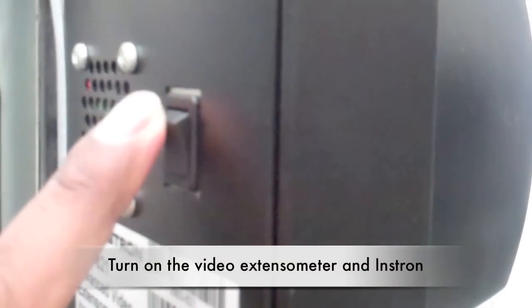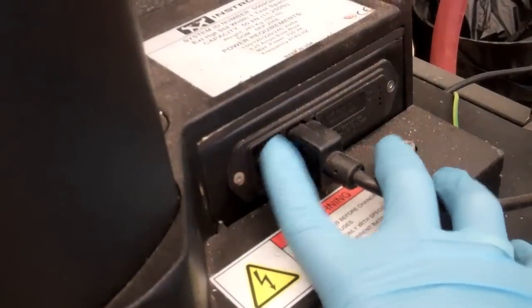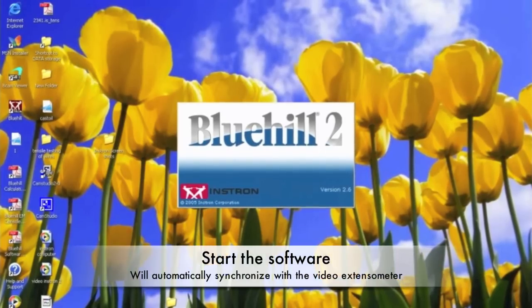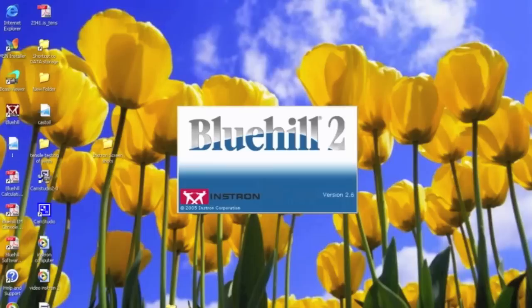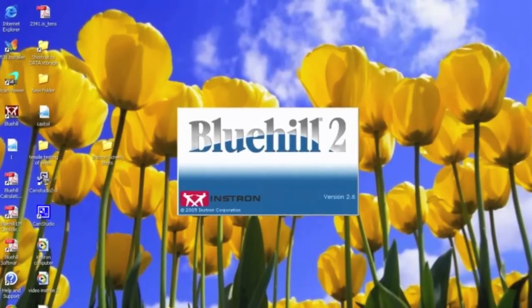Turn on the video extensometer and the INSTRON machine switches. Then open up the BlueHill software. The software will automatically synchronize with the video extensometer. If any communication errors appear, restart the software and check the connection of the video extensometer.